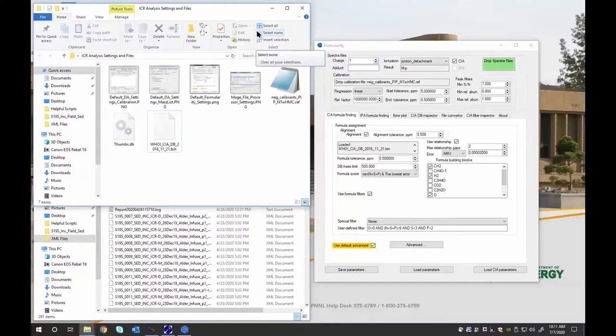But if you want to improve calibrations and make sure they are geared toward your system, it would be prudent to design your own calibration lists. Now, it's not super easy to make sure you have a good calibration list, but it would be prudent. What we've noticed currently within Wonders is that there is some difference in how good calibrations are purely based upon whether or not samples were derived from water or sediment. And again, that's the only variation between them. It's the same site, but if we have water versus sediment, calibrations change their capability.